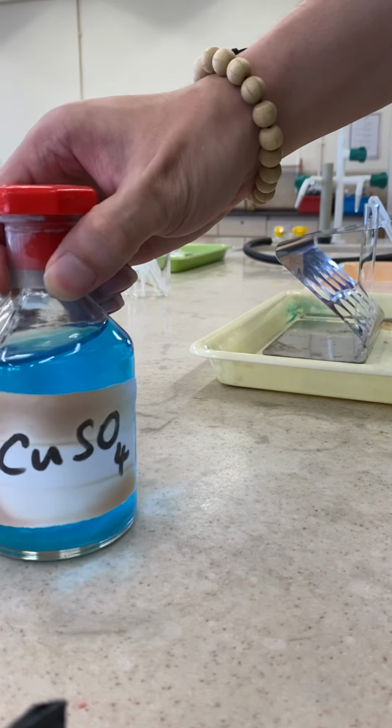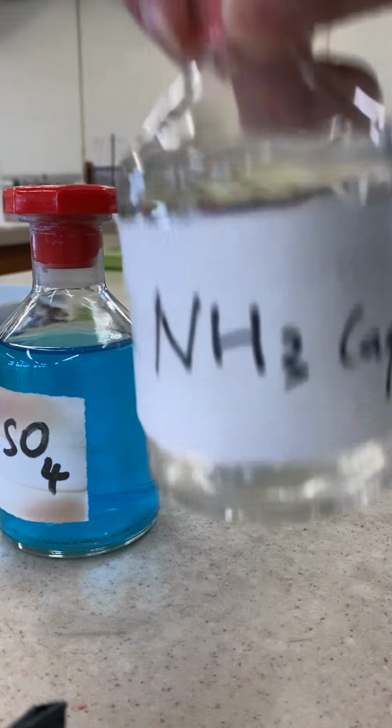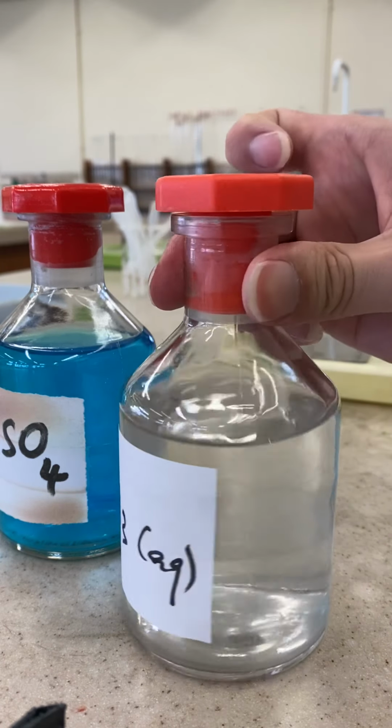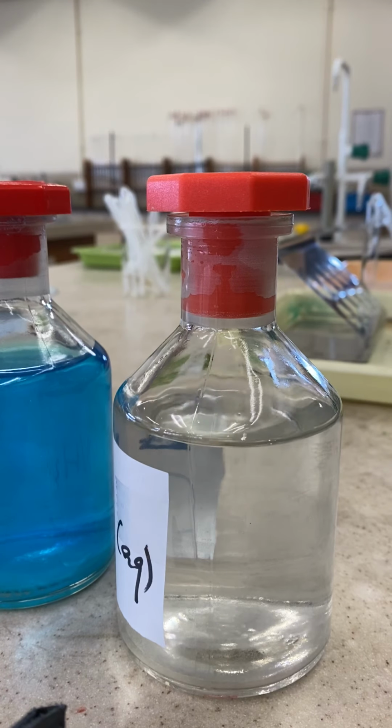First of all, the reagents involved are these two: the copper-2 sulfate, a beautiful blue solution, and this other one is NH3 (aq), that is aqueous ammonia. So my question is, when you're making this observation that copper-2 sulfate is a blue liquid and aqueous ammonia is a colorless liquid, do they turn into new substances? Obviously, no.